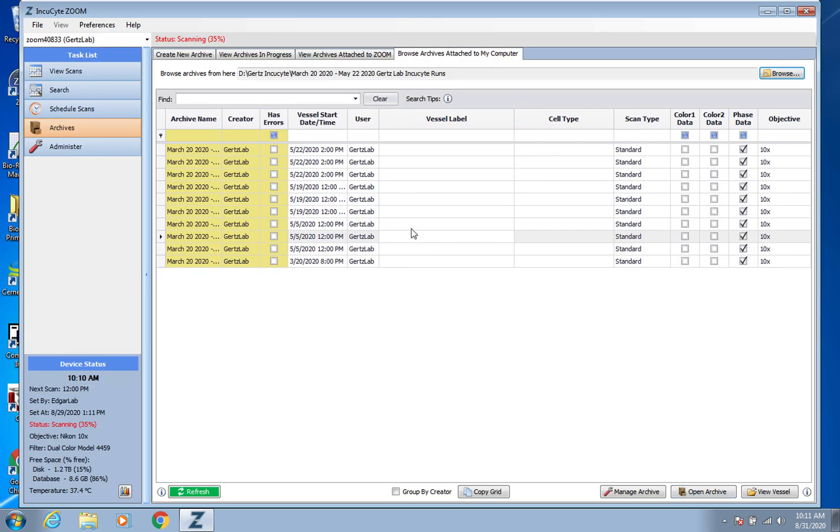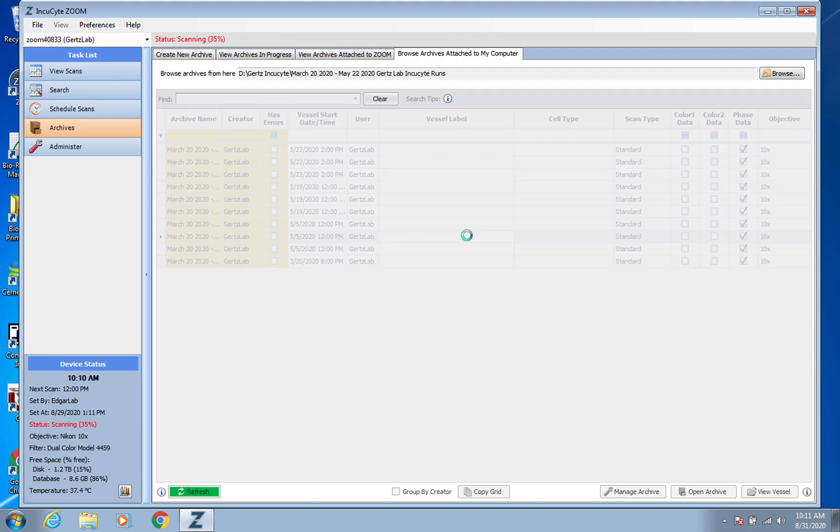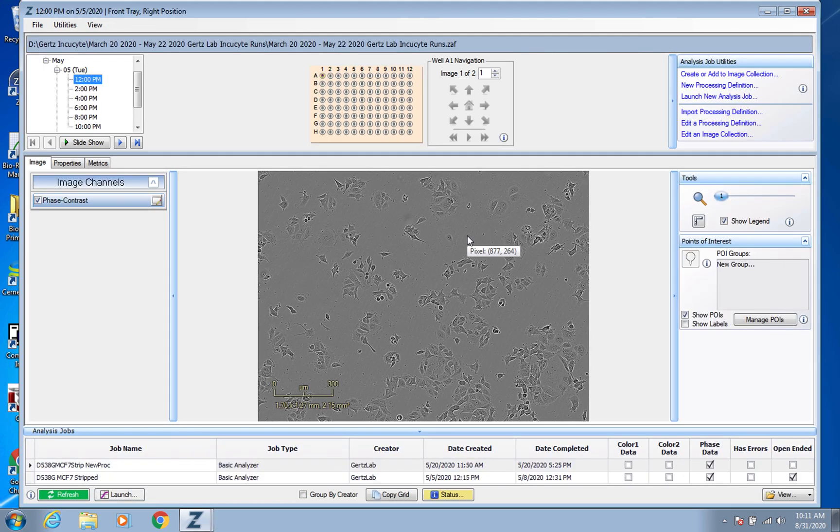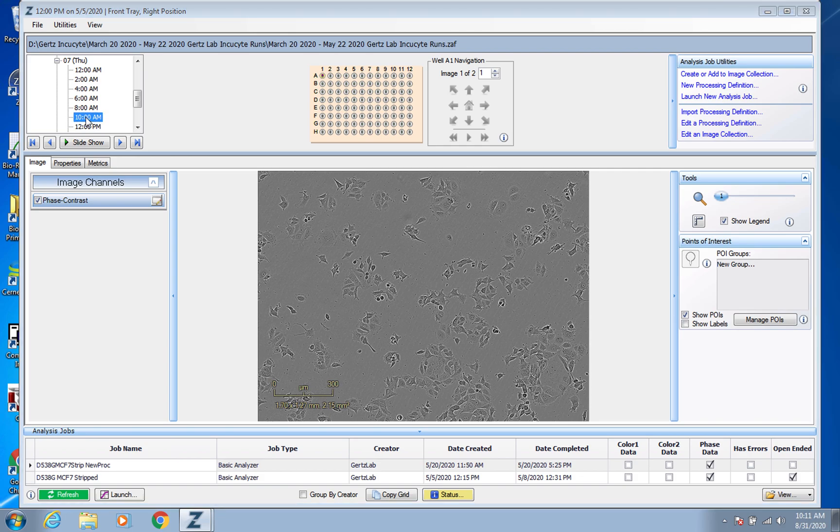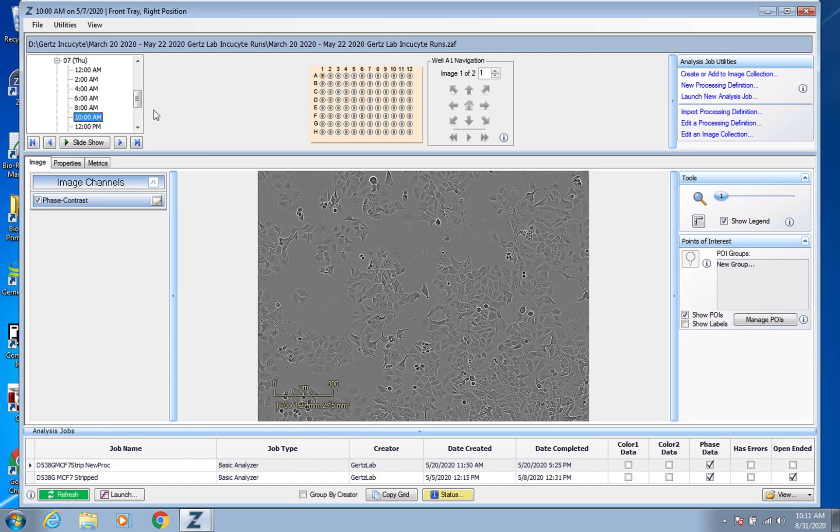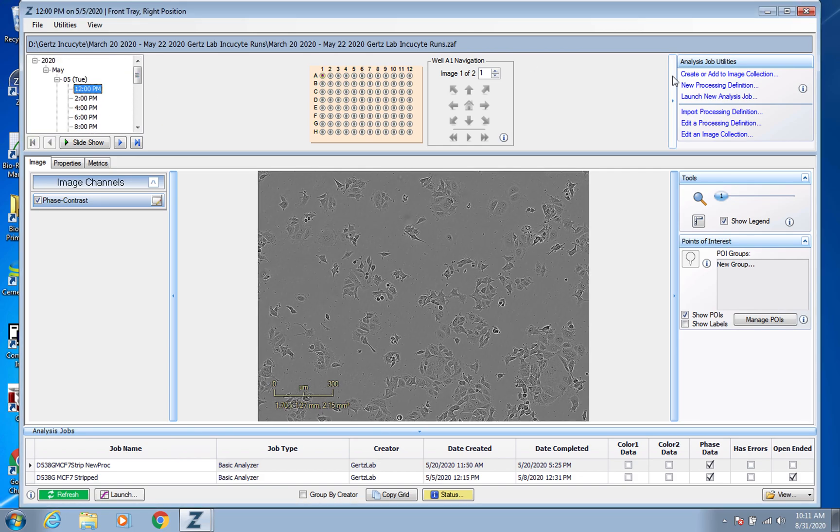So now I'm just going to pick one of these proliferation plates that we did. I believe these were some MCF7 cells. Not sure if they were treated with drugs or anything, but should be some good examples.